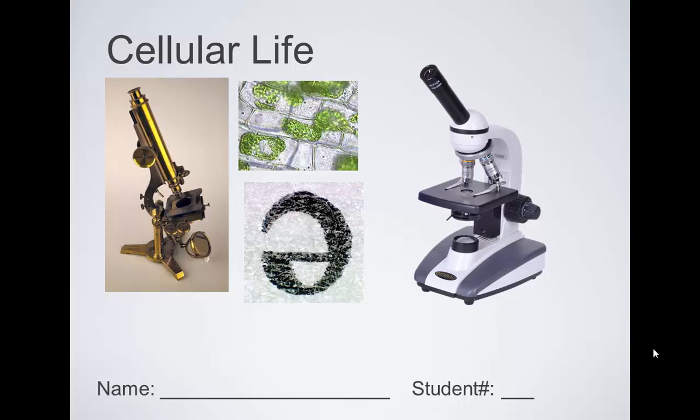So today we're just going to be introducing microscopes. Microscopes have not been around forever. They were kind of invented in the 1600s and 1700s.